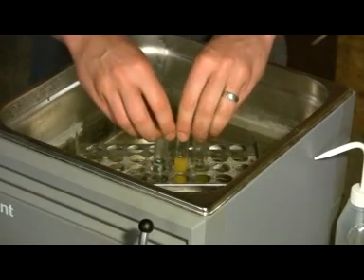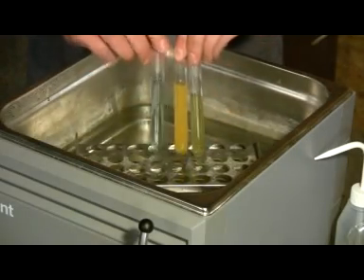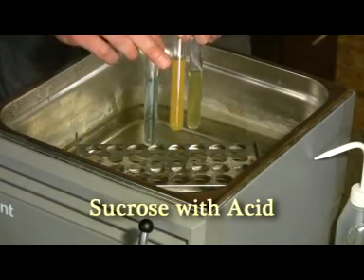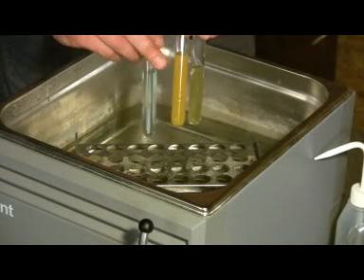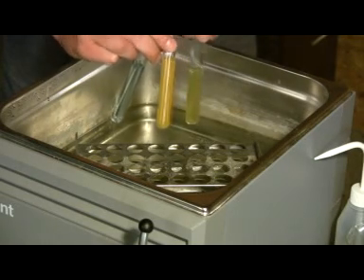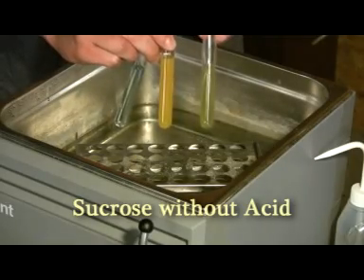So we did the Benedict test with non-reducing sugar. As you can see, this is a control with water, so no reaction. Here, this is the test tube with sugar and hydrochloric acid. So at the end, you get a reaction because you broke down the disaccharide into glucose and fructose. And that one is basically sugar, so sucrose, with no hydrochloric acid.